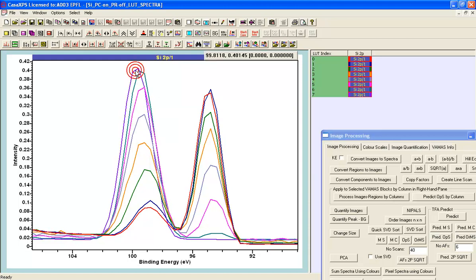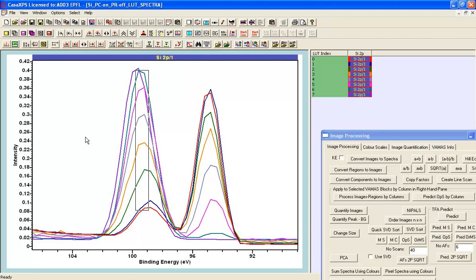Looking at the full oxide signal, which is the blue curve, and comparing it to the red signal — the other extreme where there was the least oxide — there is about a 0.9 eV shift between the two. Whether this is chemical in origin or related to the surface potential induced by different oxide layer thicknesses is open to debate. But you can certainly see that as a consequence of different oxide thicknesses, you end up with a variation in the binding energy position of the oxide peak.